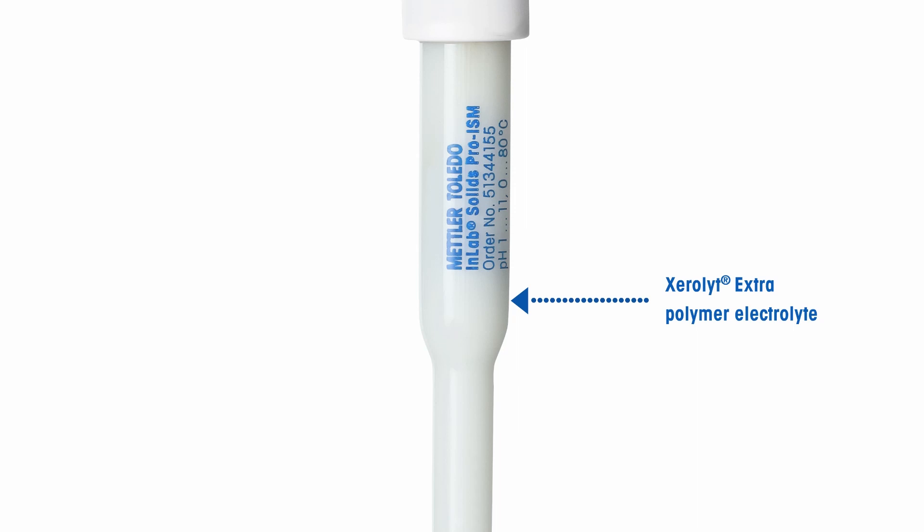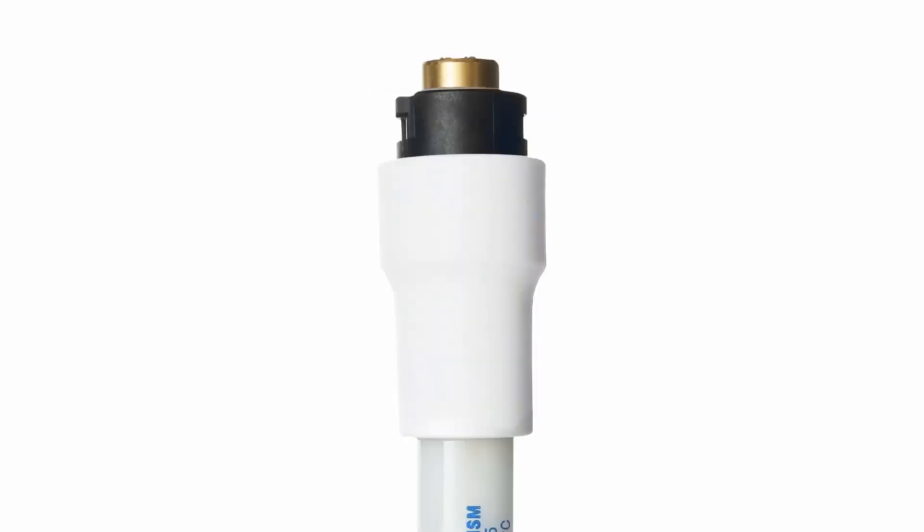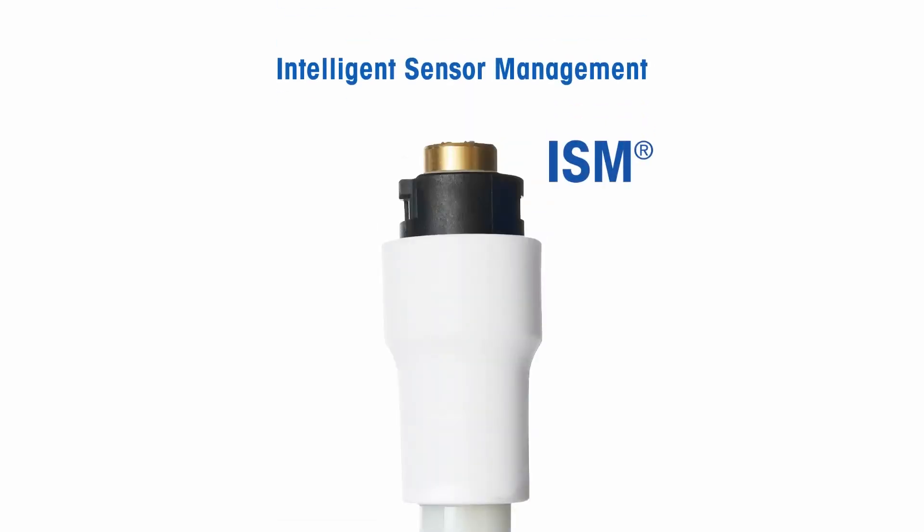No refilling of electrolyte is required. This electrode has an inbuilt temperature probe. Thanks to the Intelligent Sensor Management (ISM), the electrode's name, serial number, and calibration data are stored in the electrode itself.